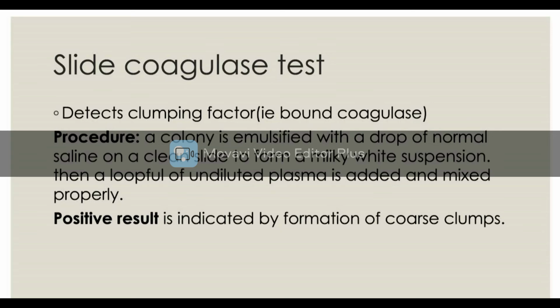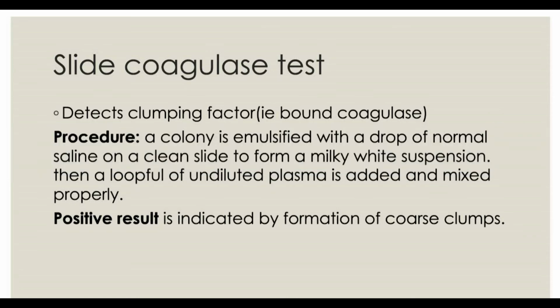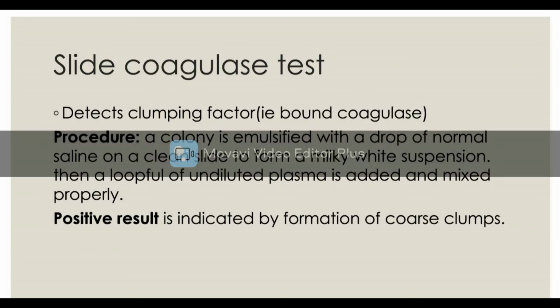And the procedure includes: a colony is emulsified with a drop of normal saline on a clean slide to form a milky white suspension. Then a loopful of undiluted plasma is added and mixed properly.